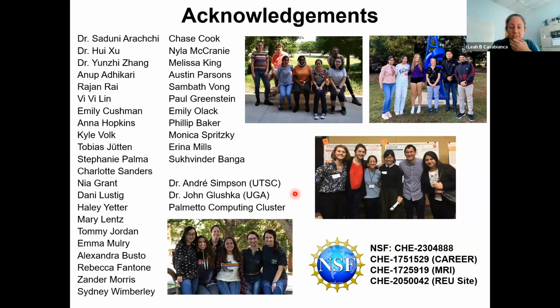Yeah, that's a really good idea. I think it was not so much of a surprise as just kind of reminding us that they're polystyrene nanoparticles, and then they have a charged group on the surface. But we can't really think of them as a hard sphere with negative charges. We do need to think of them as being sort of porous or having some sort of wrinkles on them. It's not going to be a perfect sphere because this is a soft matter polymer.